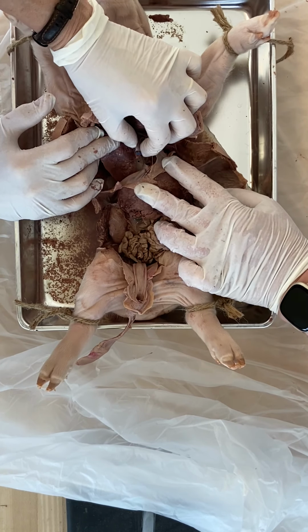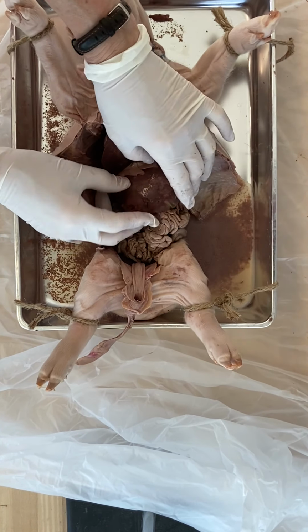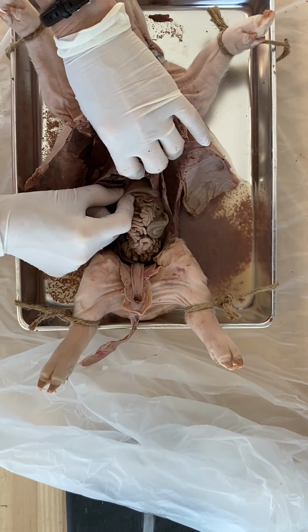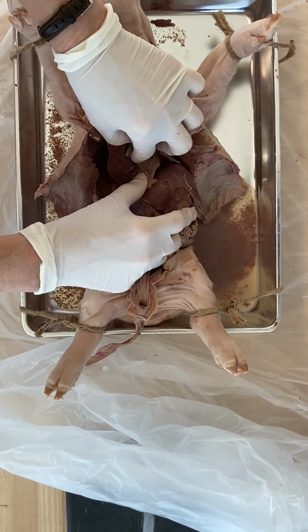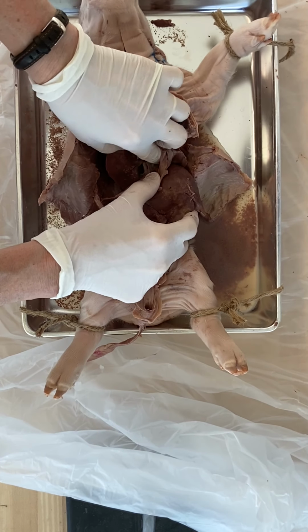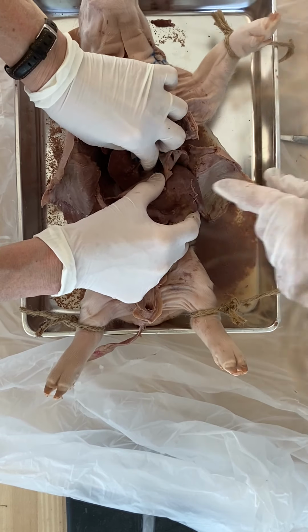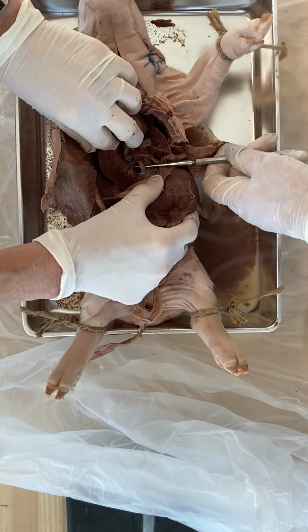I think it's the aorta, because it's so big, but where is the esophagus then, coming down to the stomach? Oh yeah, I think that's just down against the backbone. I think it's further deep. I think it's right there. But maybe I've got them backwards, but you see that? Okay. Cut that one too, let's decide which is which.